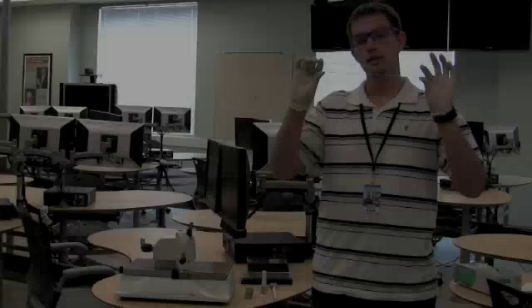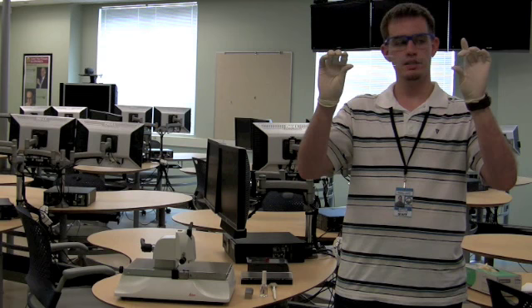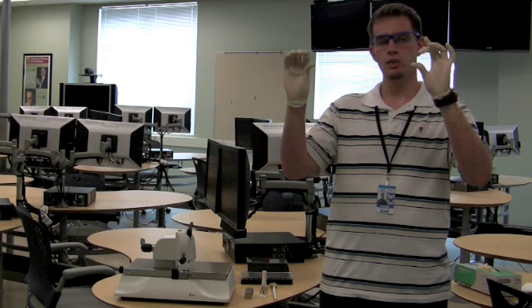This is one of the 400 millimeter pieces of glass that we're going to be using to create our glass knives. Now, there are three steps in the process of making these glass knives. The first, we're going to take this piece of glass and break it in half multiple times to create a 25 millimeter square piece of glass.